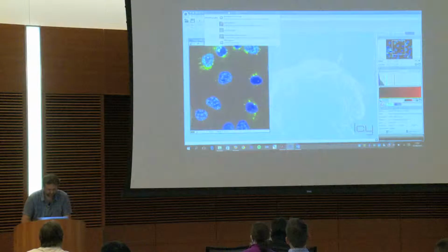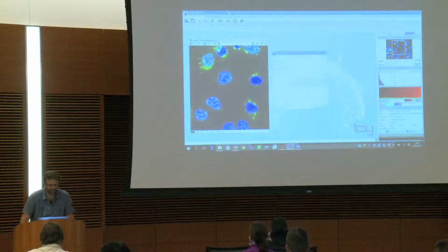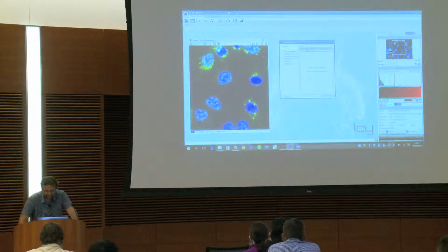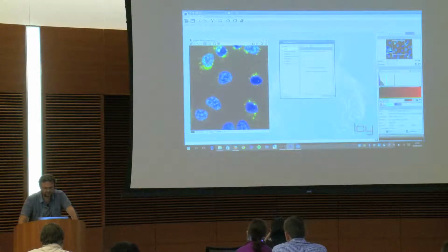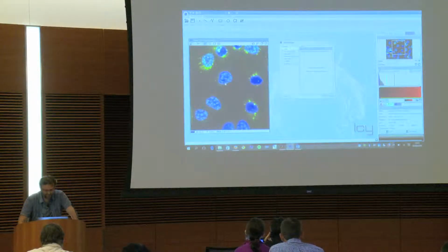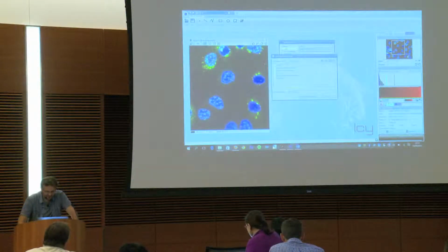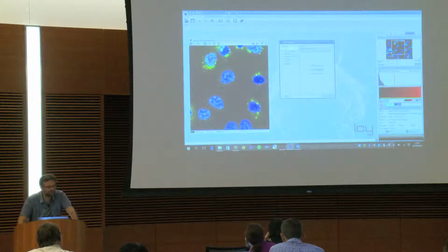And with the spot detector, it's possible to do it very simply, but you will see it's not a quality. So in the input, I say here that I want to detect the green one. Oh yeah, no, I just say I want to use this sequence here. If you wanted to batch everything, you go to batch, you select a folder, and then it will batch over this.